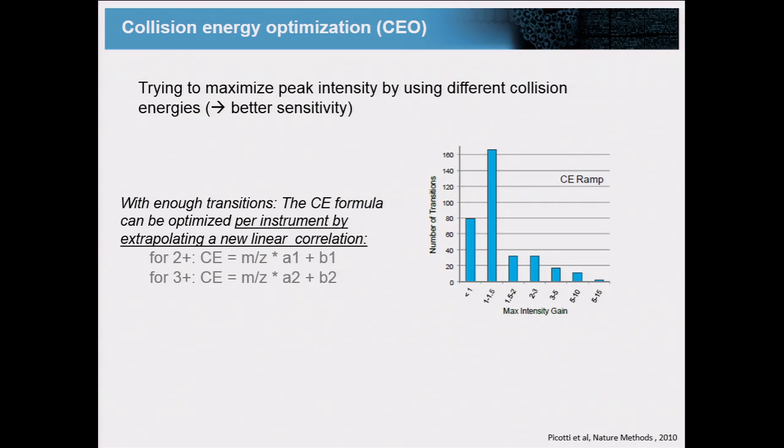What is very useful, and this is what I mentioned before, is that different labs have done this in the past on a large batch of synthetic peptides, to try and improve the collision energy formula for the machine. I can tell you in our lab we had a student working just on improving these collision energies so that all the machines are at their top performance, and from that moment on we just work with the new formulas and forget about those provided by the manufacturer.